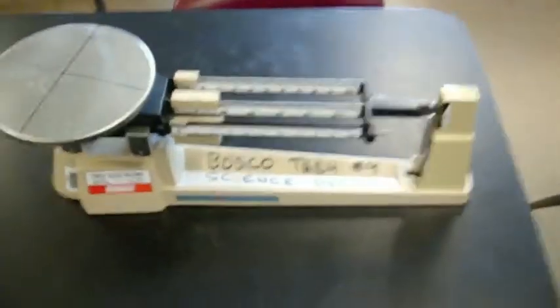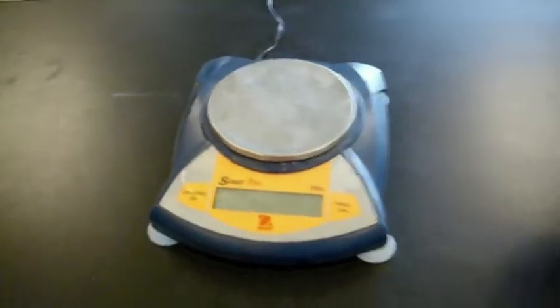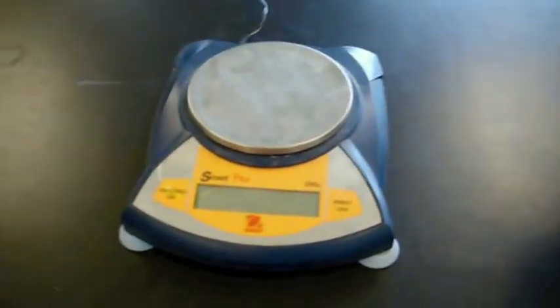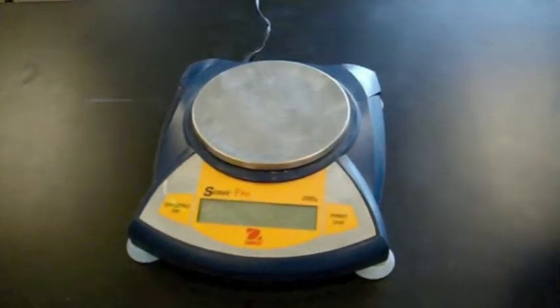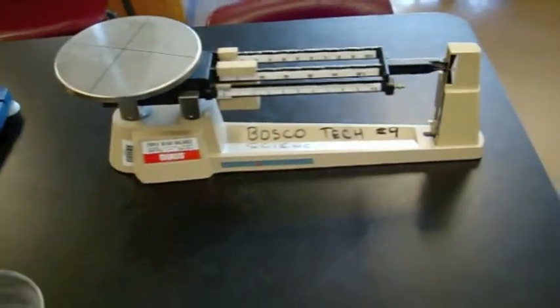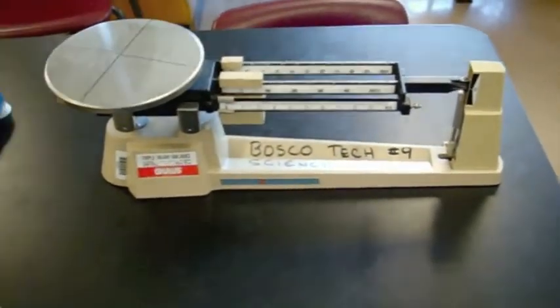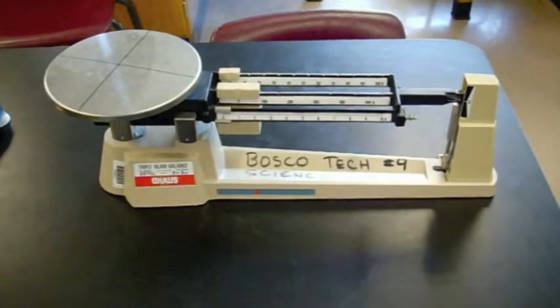Finally, in this lab, you'll need two different types of balances. There's the electronic balance, like this O-House Scout Pro. We also use some Sartorius AccuLab balances. And you'll also need a triple beam balance, much like this O-House triple beam balance here.